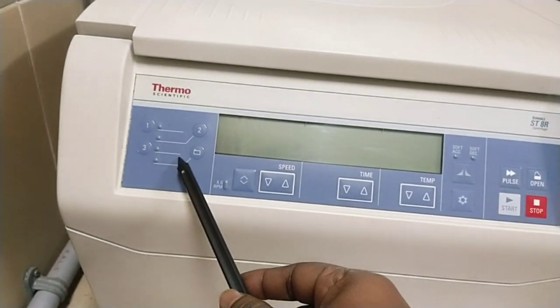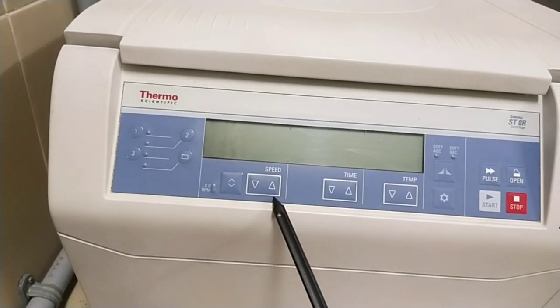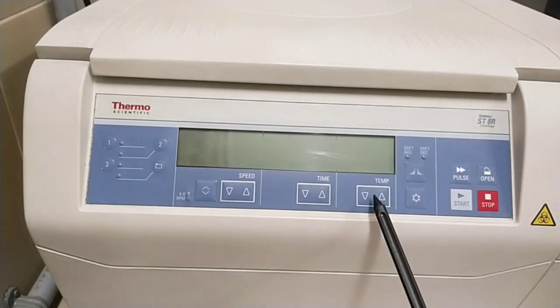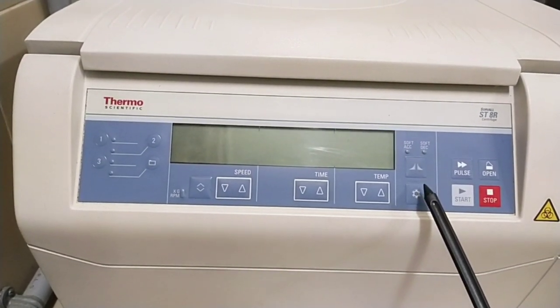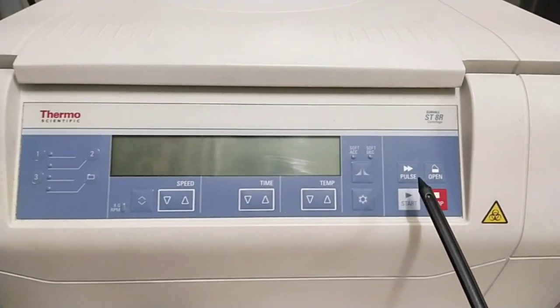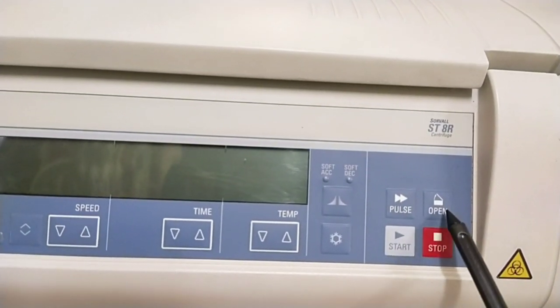The control panel consists of program keys, speed key, time key, temperature key, acceleration key, snowflake key, pulse key, open key, and start and stop keys.